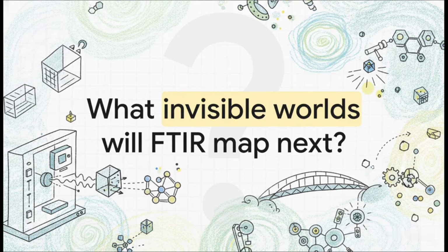And as we continue to push the boundaries of science, with resolutions now reaching down to an astonishing 10 nanometers, we really have to ask, what invisible worlds and what life-changing materials will the FTIR detective map next?